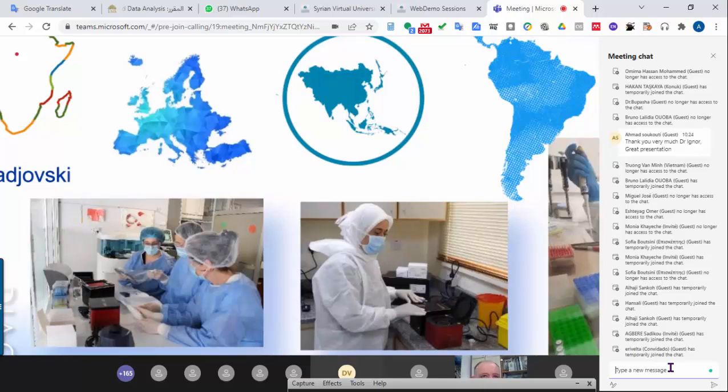As I mentioned here, we have only used the blood skin sample and the lyophilized sample, so we can say that in our verification study using these matrices, the assay performs as prescribed, or defined, and it is fit for purpose in our laboratory for this type of matrices. For any additional matrices we should perform separate or additional verification.